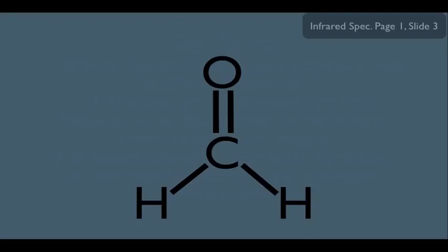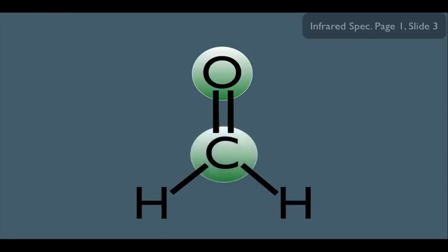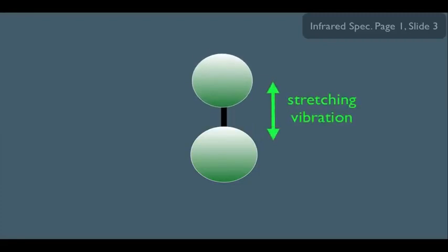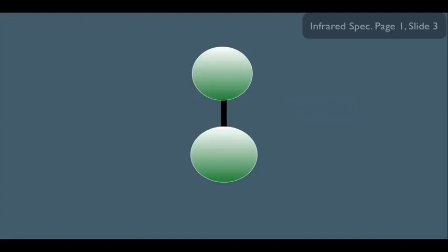you see here. For instance, let's represent the oxygen right here as some kind of sphere and the carbon also as some kind of sphere. And the double bond between them, let's represent it as this single bond right here. If you were to actually see a formaldehyde molecule, you would see the carbonyl bond do something like this. It would stretch and compress like this, almost as if there is a spring between the carbon and the oxygen. But that's not the only thing this carbonyl can do.